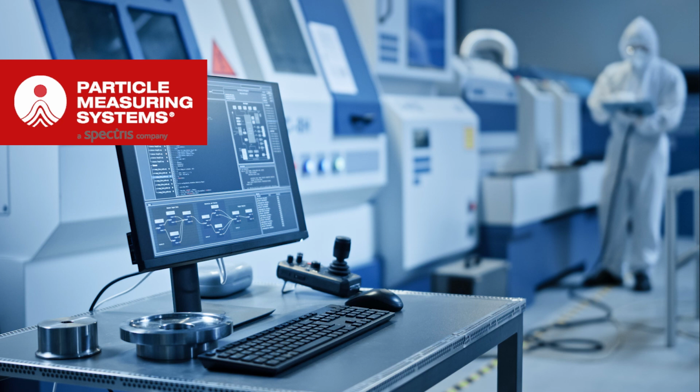It's not imposing a regime of too many sample points, because too much data can be a dangerous thing too. Yes, it's that balance between what do I need and what do the regulators need to see to demonstrate control over the environment. It's not necessarily control over finished drug product quality. This is control over the environment in which drug products are manufactured. And there are some pretty stringent rules and guidelines that are out there for us to follow.